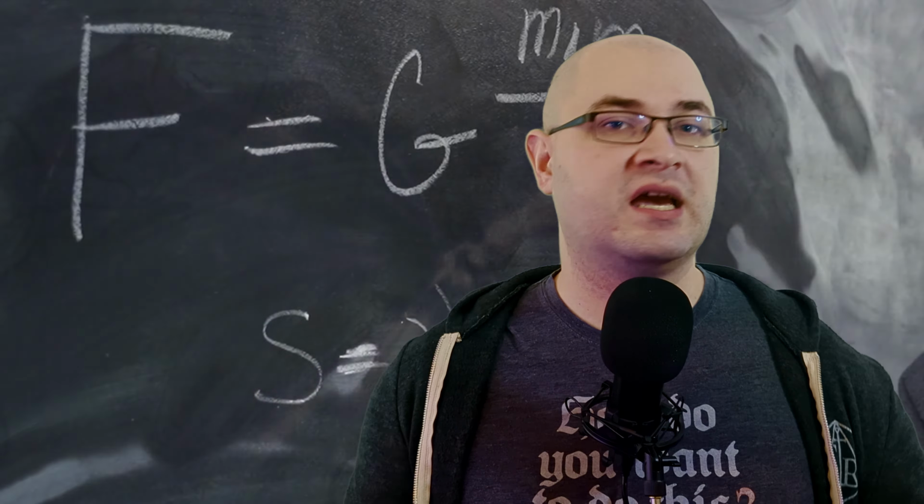What scientists needed was a new source of X-rays, a light source that was incredibly bright, millions of times more intense than an X-ray tube. It had to be highly focused into a thin beam, and most importantly, the energy needed to be tunable. You need to be able to pick a precise energy, measure the absorption, then dial the energy up ever so slightly and measure again, mapping out those wiggles in excruciating detail.